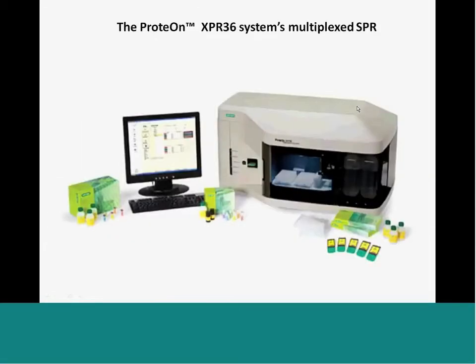So in the next slide there is a picture of the Bio-Rad ProteOn XPR36 multiplex SPR system. There's a computer which is connected to the SPR machine. There is a chip, and there is a robotic machine for the auto sampling, and there is some buffer storage.